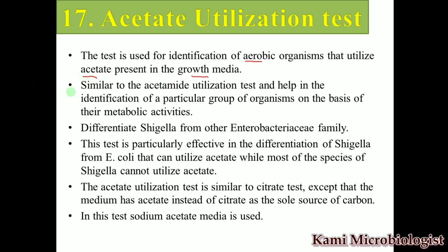The next point says that this test is mostly similar to another test which we call the acetamide utilization test. Inshallah, we will also explain this test in some other video lecture in detail. Due to the similarity of this test, we can isolate and differentiate bacteria on the basis of their metabolic activity, or we can say by utilization of acetamide we can differentiate the bacteria.